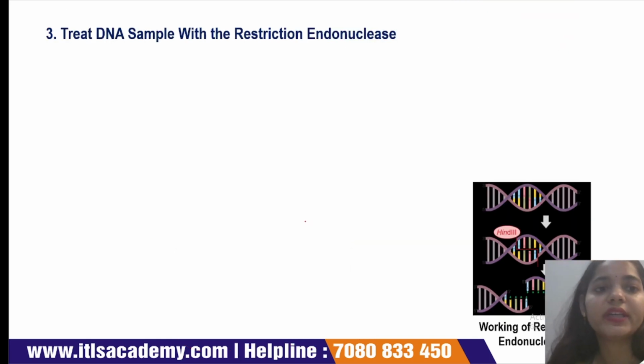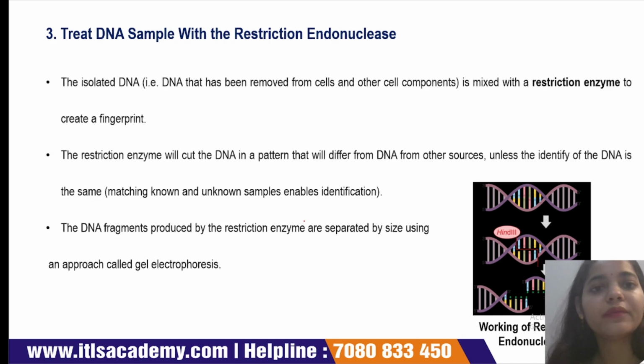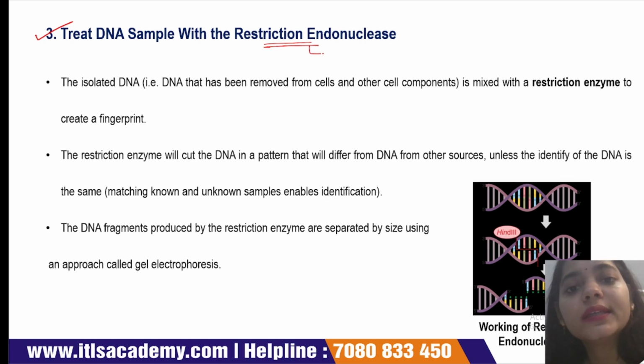Now we understand the treatment of the DNA sample with restriction endonuclease. What is restriction endonuclease? Restriction endonuclease is a type of enzyme which cuts the DNA at a specific site.